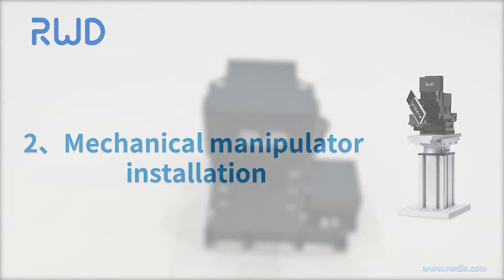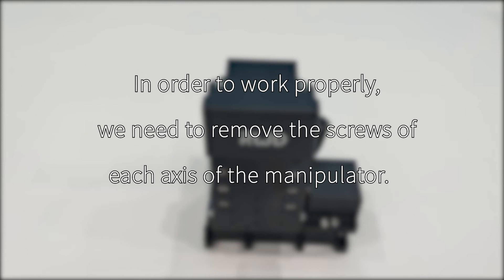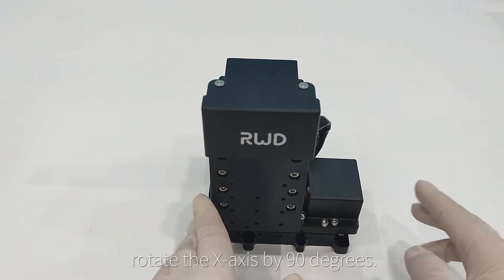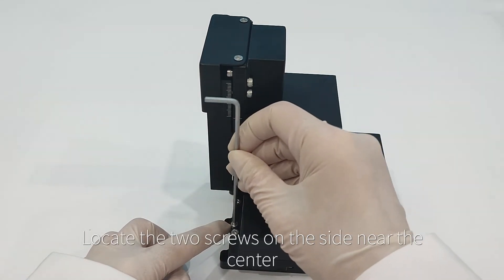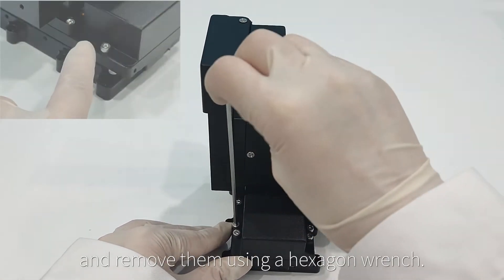Section 2: Mechanical manipulator installation. To prevent transportation damage, the slide track is locked by six screws before leaving the factory. To work properly, we need to remove the screws on each axis. For the X axis, rotate it 90 degrees, locate the two screws on the side near the center, and remove them using a hexagon wrench.